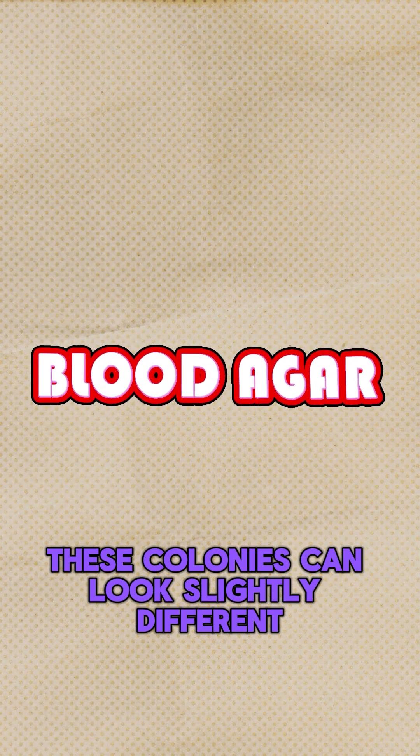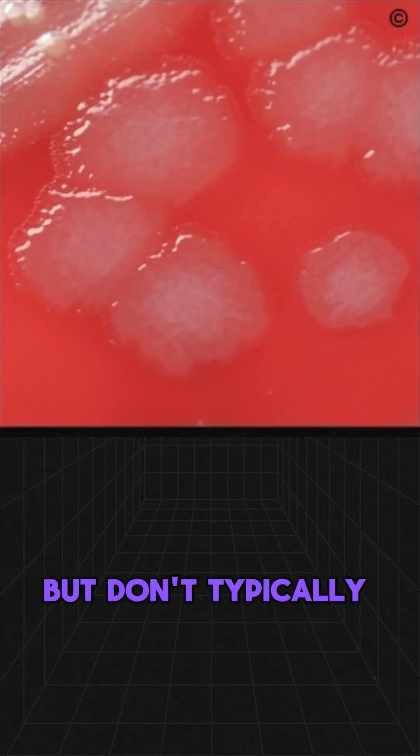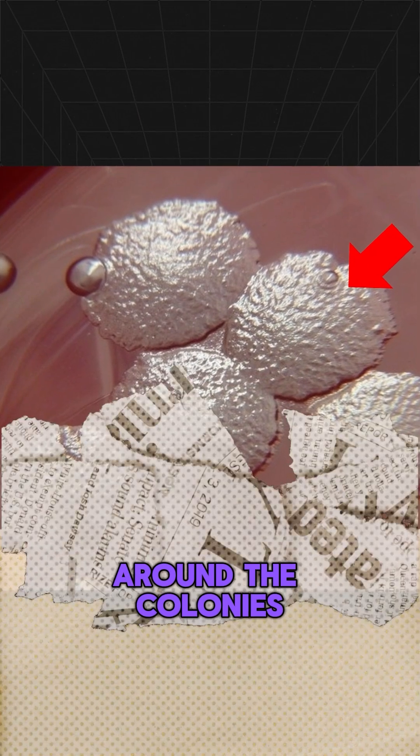these colonies can look slightly different. They maintain their size and shape with slightly irregular edges, but don't typically haemolyse the red blood cells, keeping the agar's original colour intact around the colonies.